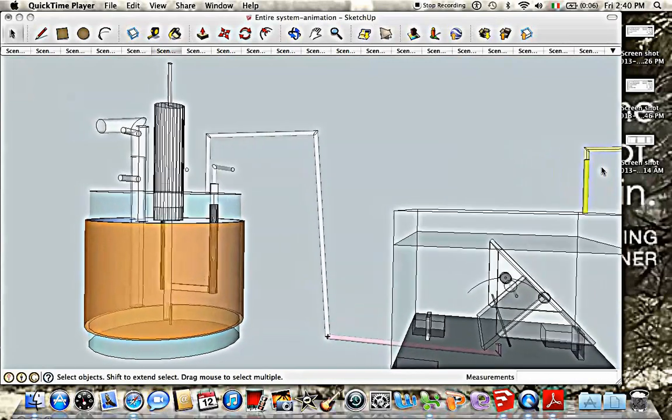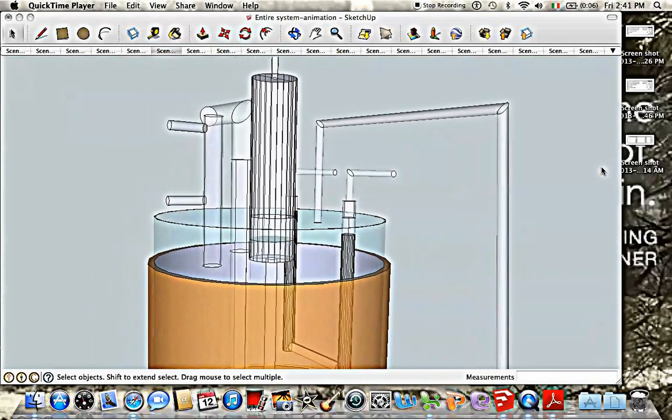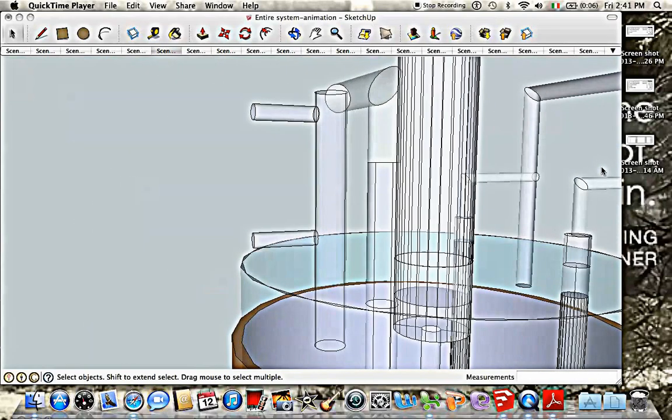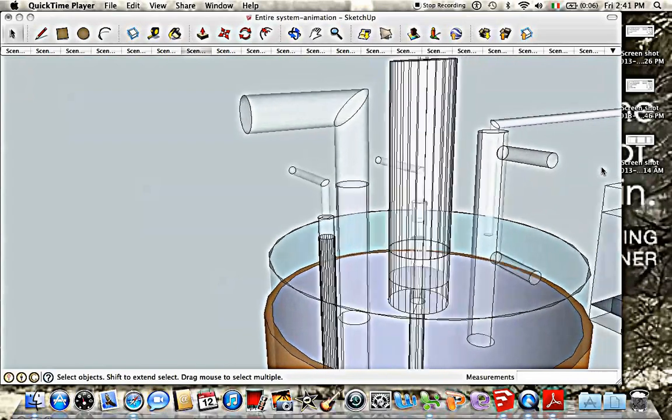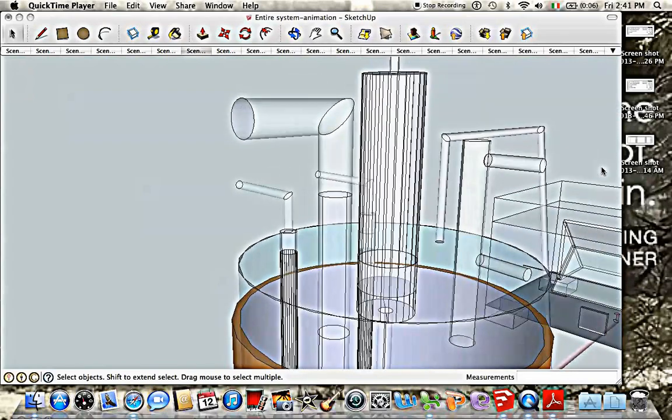As we zoom in here on the left on the anaerobic digester, we see a condenser. The two pipes protruding from the cylinder will be connected to a controller. This controls the temperature of the anaerobic digester process.